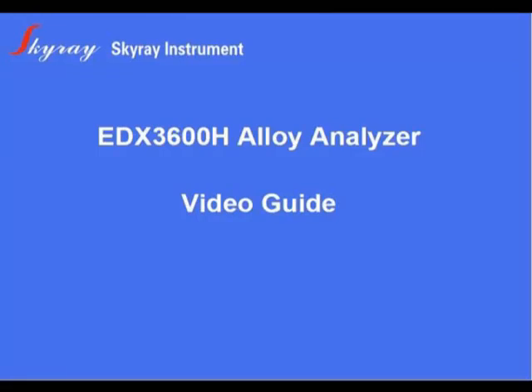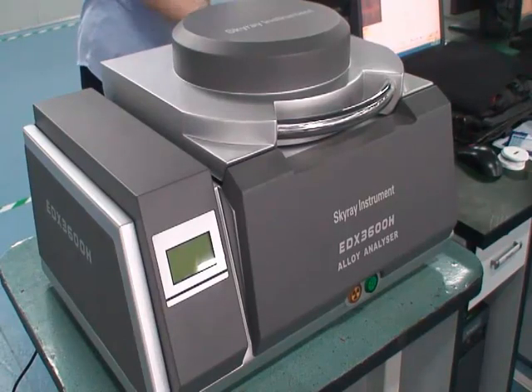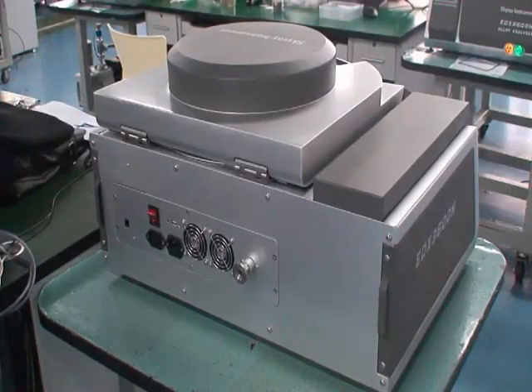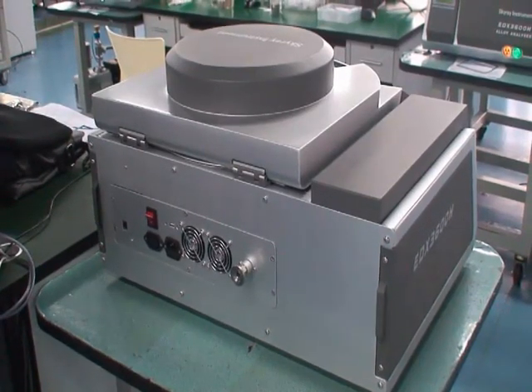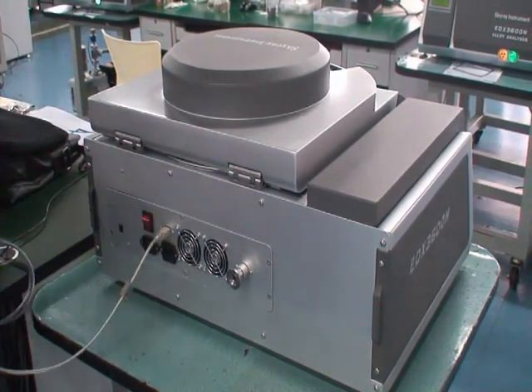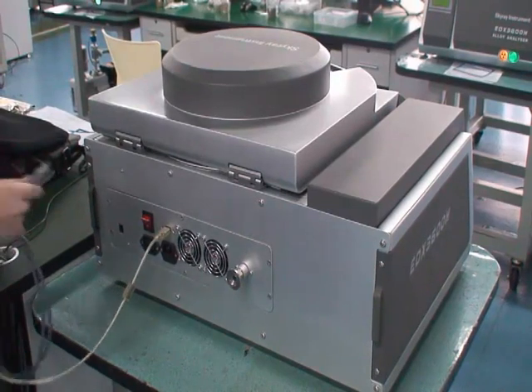Welcome to the EDX 3600H alloy analyzer video guide. First, correctly connect the device and the vacuum pump.